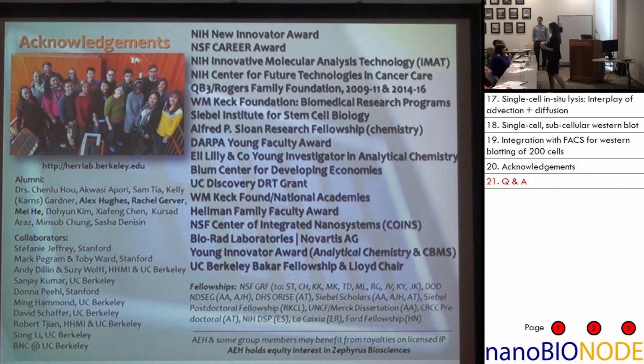How do you compare them? Okay, I'll answer it, and then you tell me if I am answering or not. So essentially what we do is we take the biopsy or the tumor and we dissociate, so we chemically dissociate the extracellular matrix and break up the tissue so it's a suspension of cells.